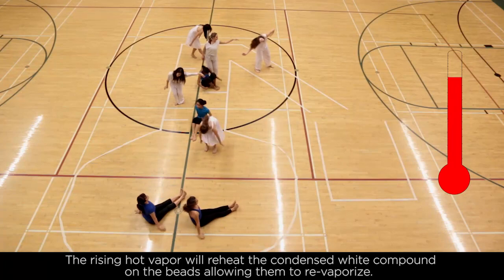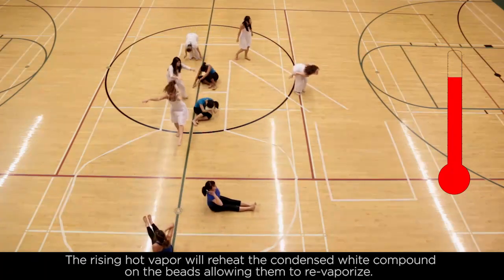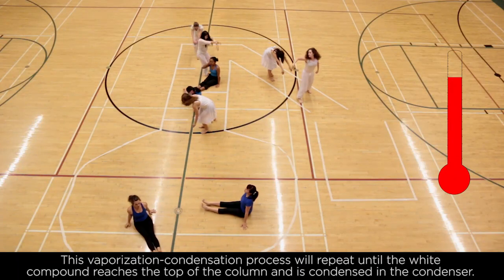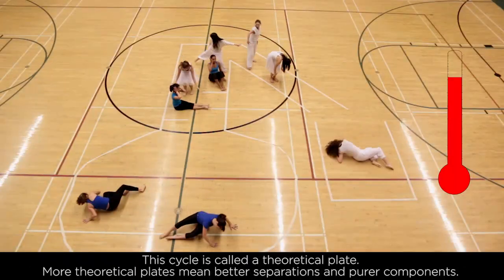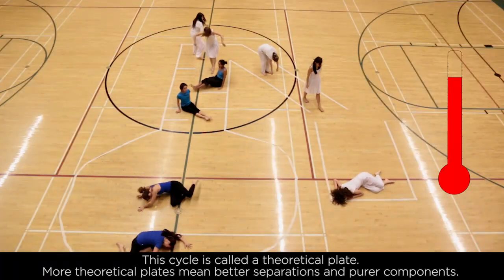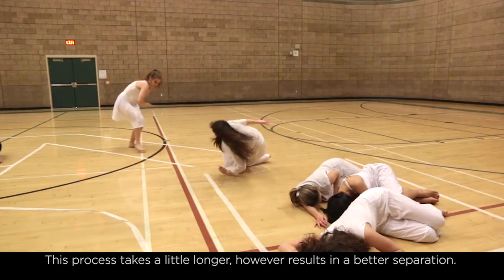The rising hot vapor will reheat the condensed white compound on the beads, allowing it to revaporize. This vaporization-condensation process will repeat until the white compound reaches the top of the column and is condensed in the condenser. This cycle is called a theoretical plate. More theoretical plates mean better separations and purer components. This process takes a little longer, but results in better separation.